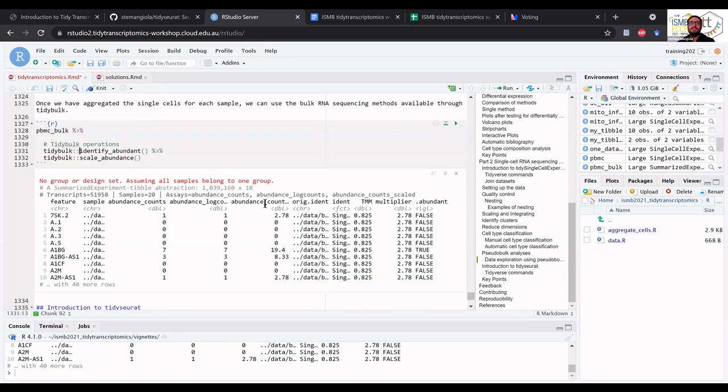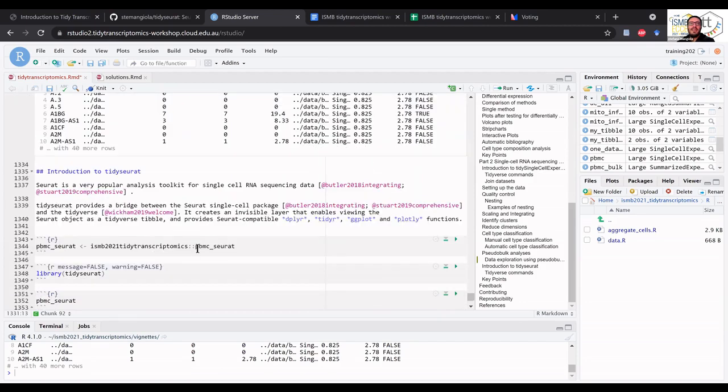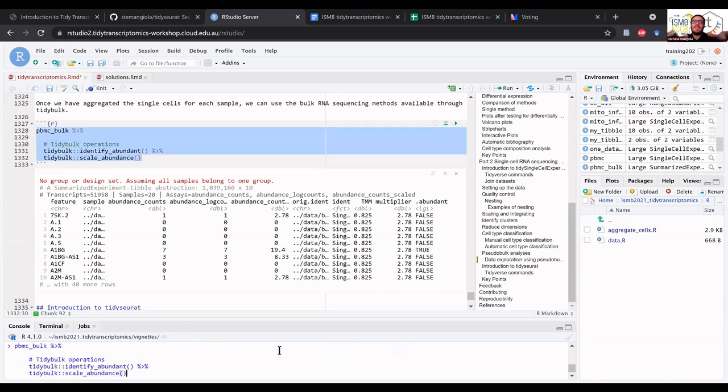Again, you can see here the scaled counts. And again, we can do cool things. For example, since we have a couple of minutes, I can show you, we are scaling, and then we can, of course, reduce dimensions. And again, we might plot those reduced dimensions in two-dimensional plots, and see which of those samples are more similar to each other.